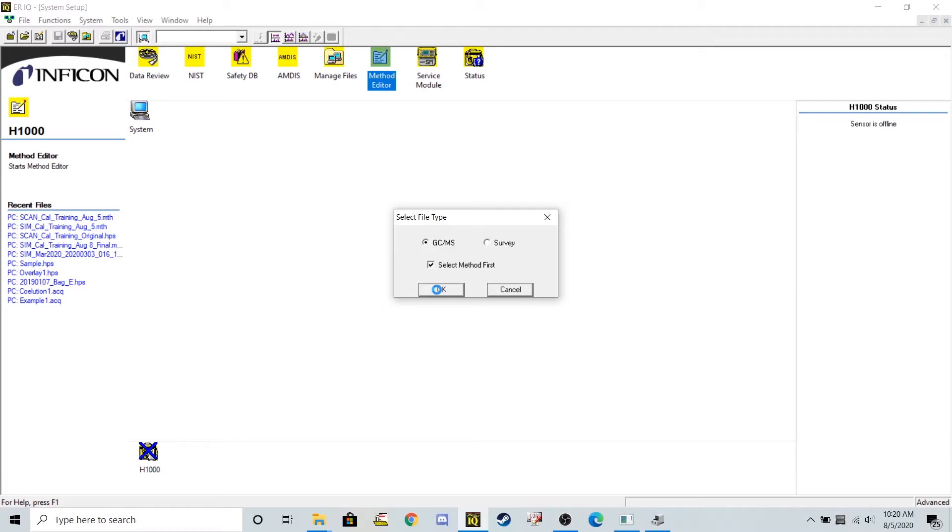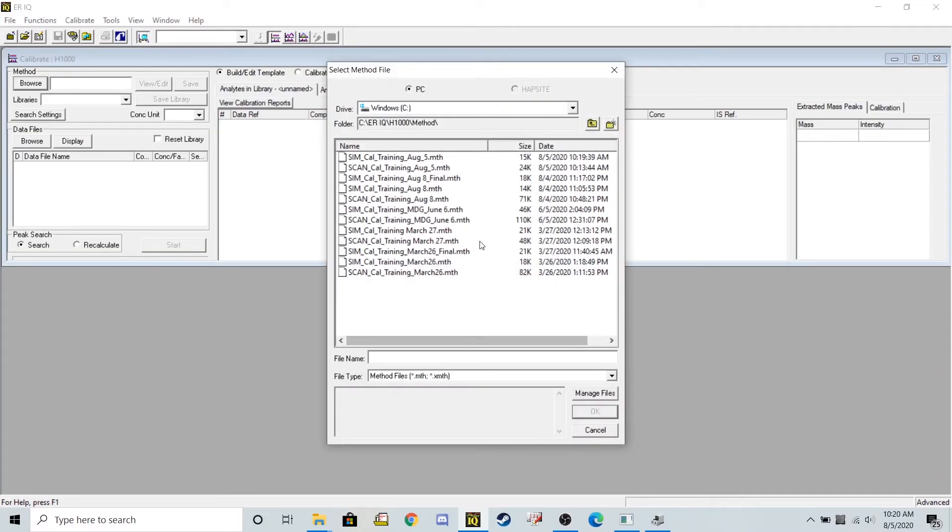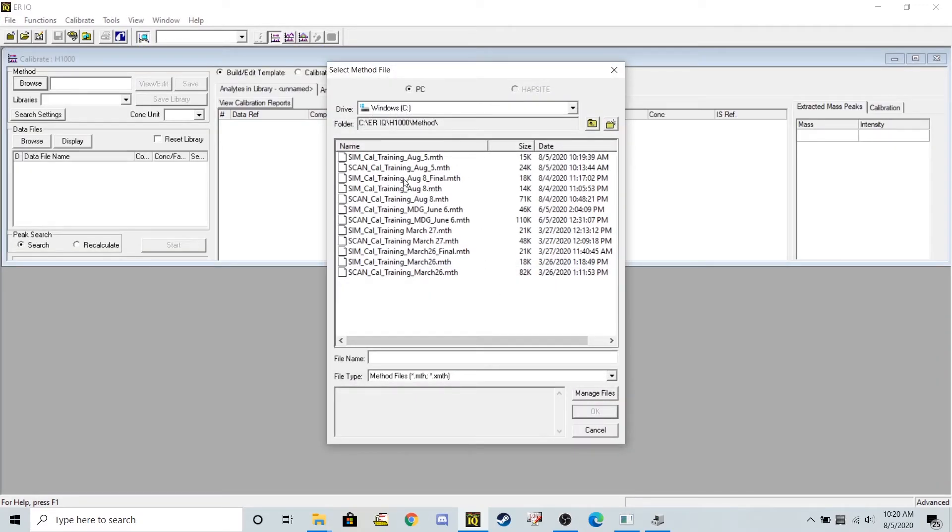So those would need to be made on that newly created method, or run on that newly created method. So let's go ahead and select our SIM method, August 5th.